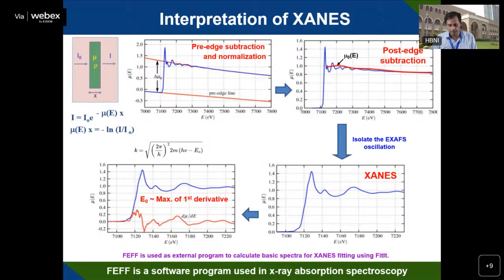The XAFS analysis, or the XANES analysis, the interpretation part is quite difficult as compared to normal X-ray diffraction or other characterization techniques. Mainly you use FEFF, a software that is commonly available for analyzing this type of spectroscopy. I'll just broadly discuss the steps involved in the interpretation.